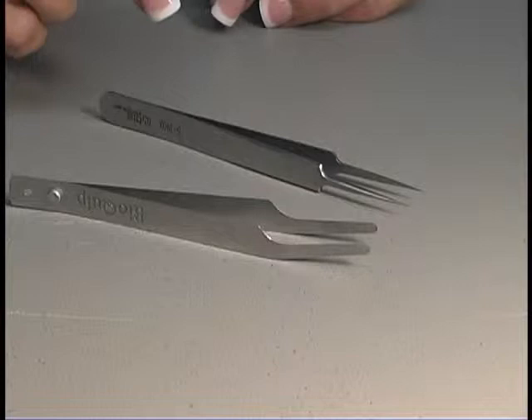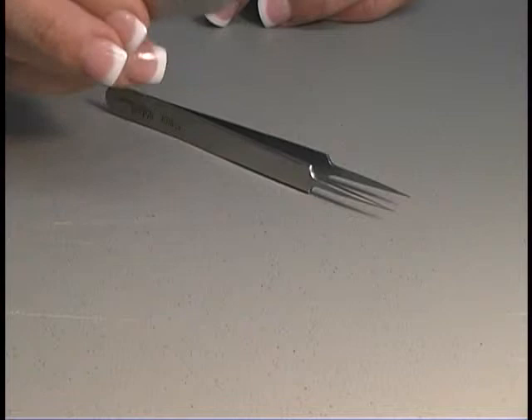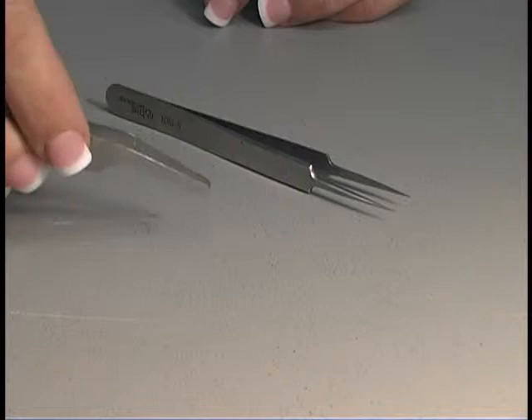For getting the insect legs correctly placed as well as their wings, we can use different tools such as forceps. Soft forceps can gently guide those wings into place when you're spreading them, as well as to guide the legs and for pinning.